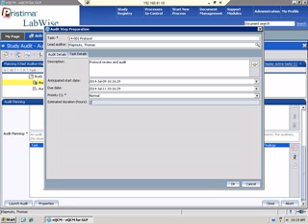And again, a lot of this metadata isn't required. The only thing that's required, you'll see an asterisk. That's the field that's required. And so if you wanted to, trying to plan out how long an audit takes, estimated time versus actual time, putting this information in, it'll have the start time and end time when the audit is initiated and when the audit is completed to give you an actual duration of how long it took the audit to happen.